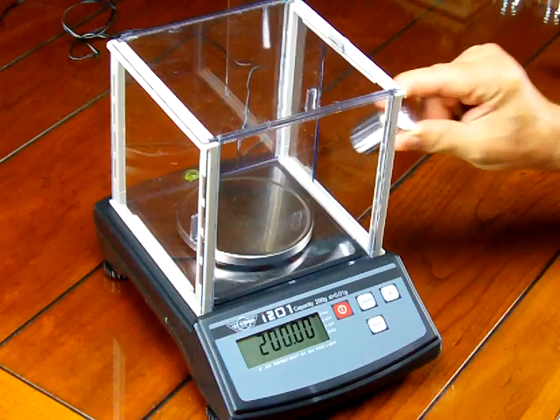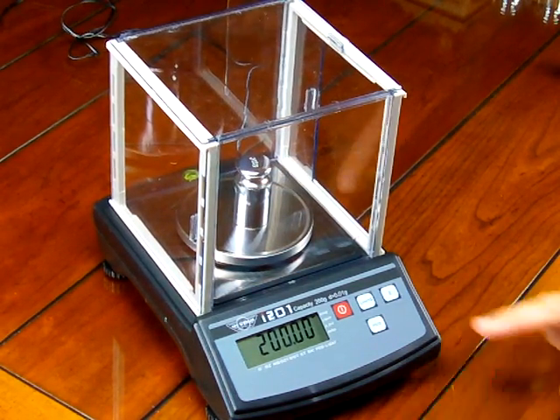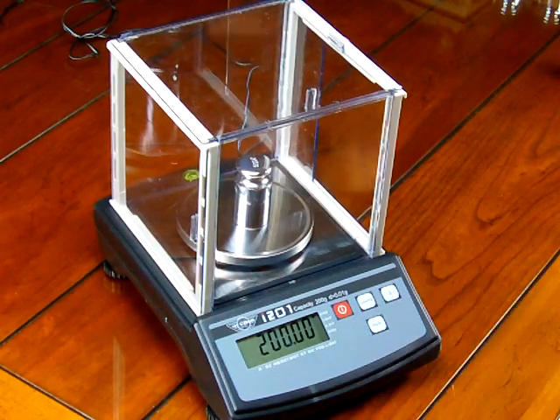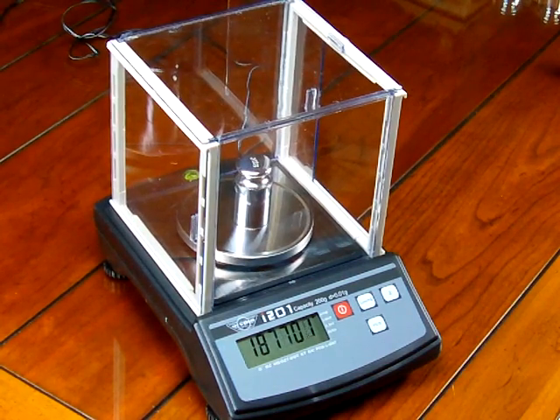Now we need to put the 200 gram calibration weight on the center of the platform. Once again, press the unit key, and you'll notice it will say zero, zero, save. Then there'll be another value — this is the value of the A to D converter at full capacity.